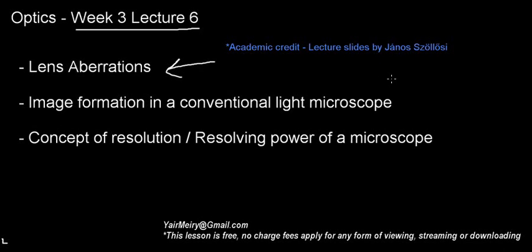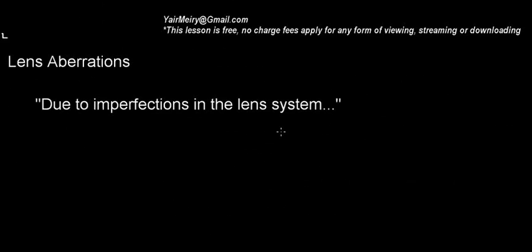because they're very useful. We're going to talk a little bit about image formation with the conventional light microscope. And just to get it out of the way, by light I don't mean the opposite of heavy. This is a light microscope in the sense of visible light. Concepts of resolution, what do we mean by resolution, which is really important to understand, and the concept of the resolving power of a microscope. So let's get started here.